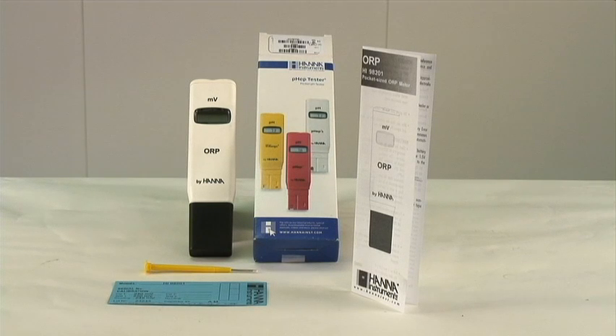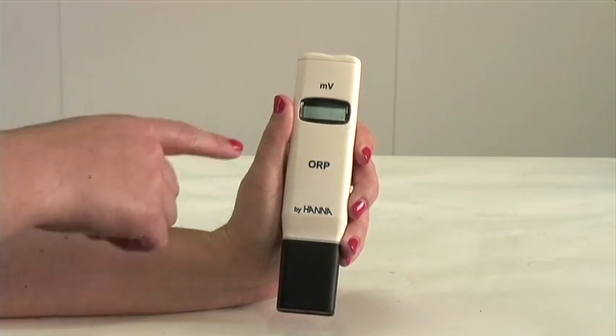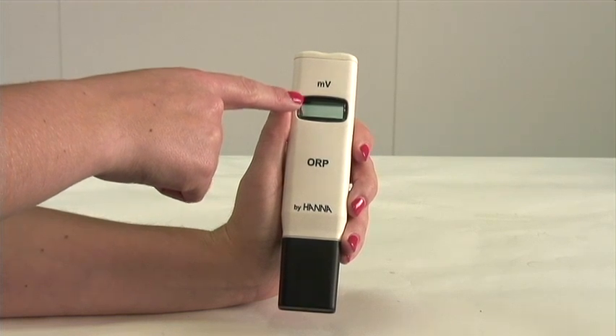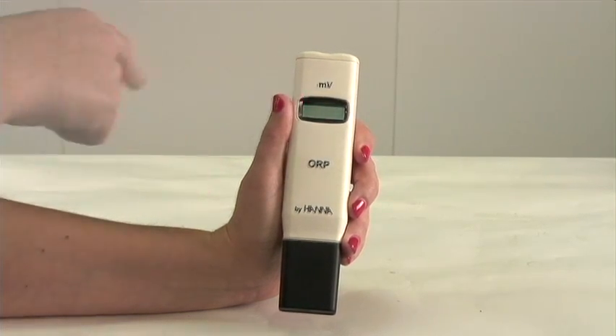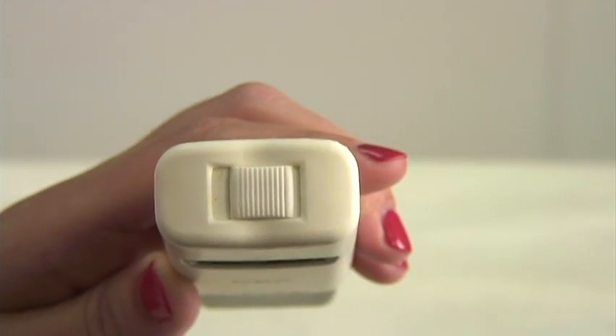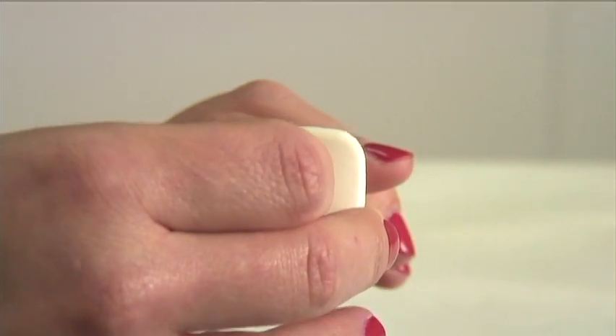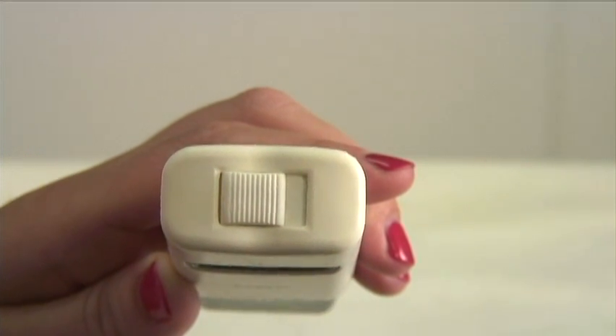Now let's take a look at the features in operation of your 98201. Your measurement readings will appear here on the liquid crystal display screen. On the top of your meter, you have the on-off switch. To turn your meter on, simply slide the on and off switch to the left.